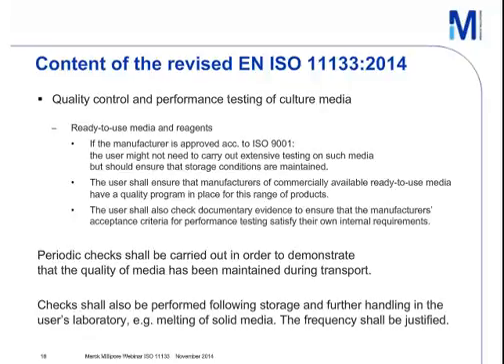For ready-to-use media and reagents, it is mentioned in the standard that if the manufacturer is approved according to ISO 9001, the user might not need to carry out extensive testing on such media, but should ensure that storage conditions are maintained.